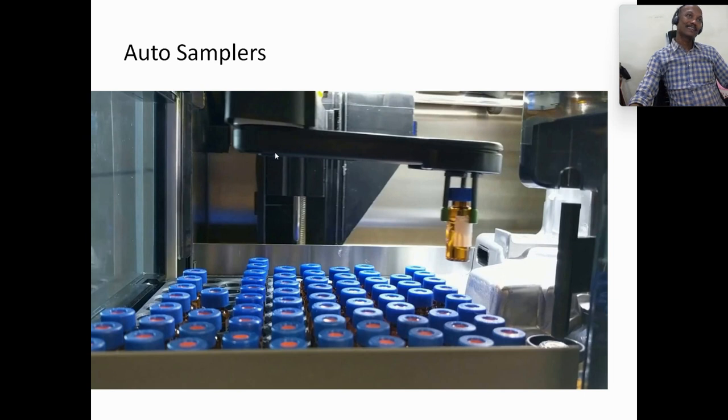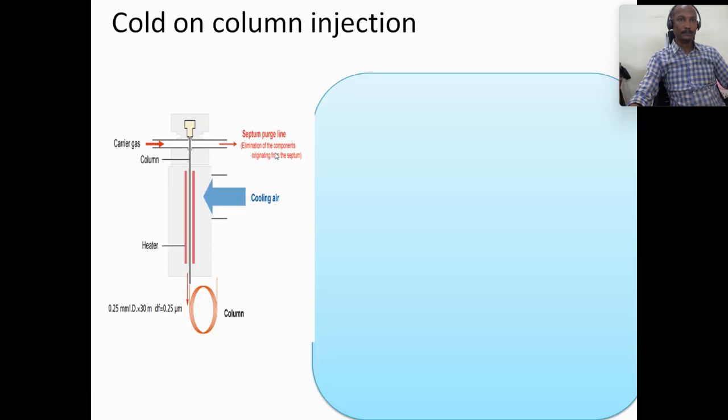Next, recently, in many chromatography techniques, the majority of injections can be done automatically. That's why we are using autosamplers. It is one of the widely used and accepted techniques.